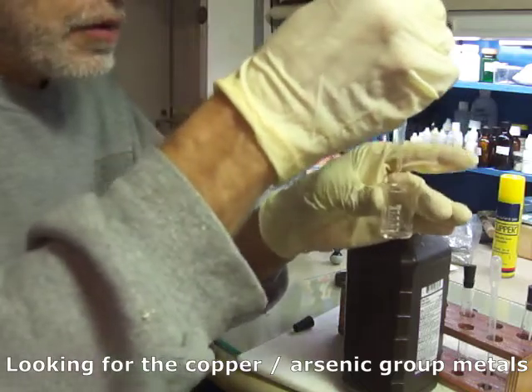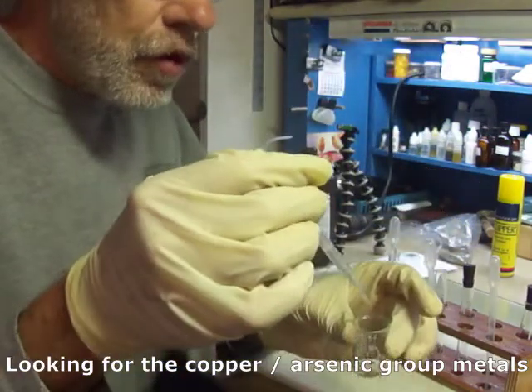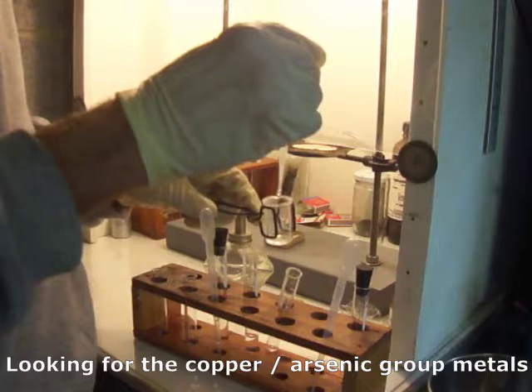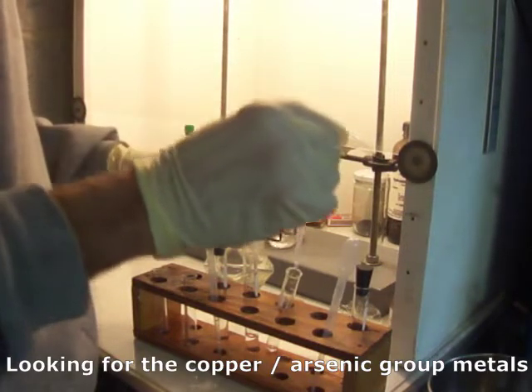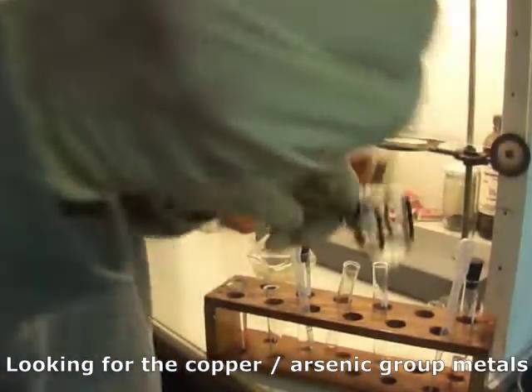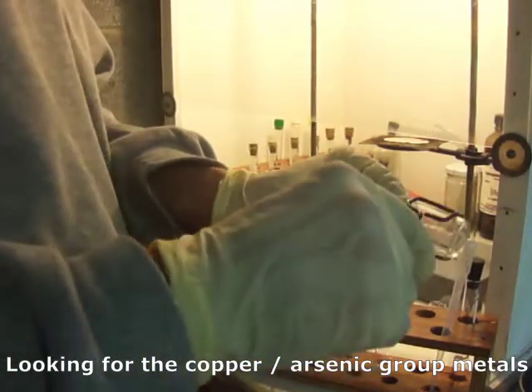We add 2 drops of 3% hydrogen peroxide and a couple of drops of 2 molar hydrochloric acid. We boil the volume down to 1 to 2 drops. Now we add 6 drops of 6 molar hydrochloric acid, and we heat that down to a gummy mass. Now we add 4 drops of 2 molar acid and transfer that to a test tube.